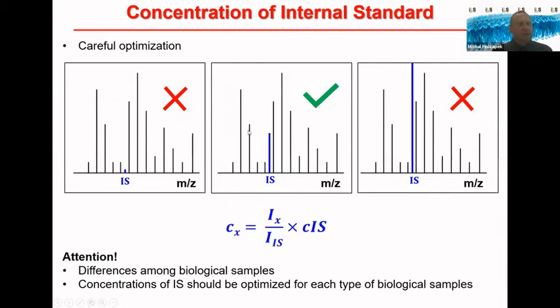The reason why I don't like too much the pre-mixtures of internal standards provided, for example, by Avanti, is that you really need to tailor perfectly the concentrations of internal standards. Here you see 2 cases where the concentration of internal standard in comparison to other species within the class may be too low, or in this case is too high.